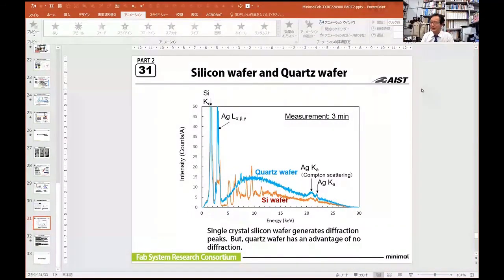It is difficult because you don't control the contamination in your space. So the wafer becomes dirtier as time elapses, and if you move the wafer, it is degraded or contaminated. In a minimal fab, the contamination is controlled because it is removed from inside the minimal fab. So this kind of thing is very easy to do. For us, it is very easy if you use a minimal fab. That's why I can say we have a very clear image of the contaminants and problems.